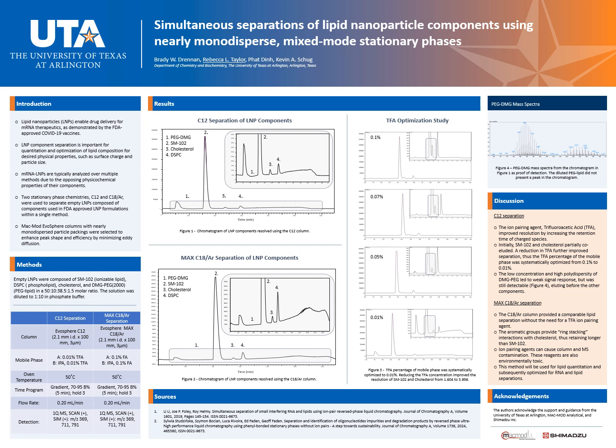As the IPA percent increases, it kicks off contaminants and the signal is shown for them. This is not visible in the previous C12 study because TFA is known to suppress ionization. Since then, the detector has been cleaned and the increase in baseline decreased.